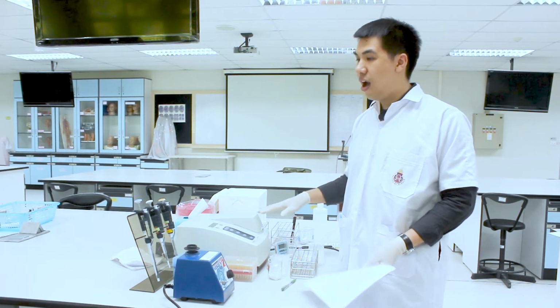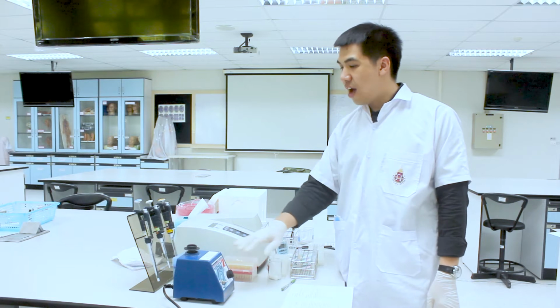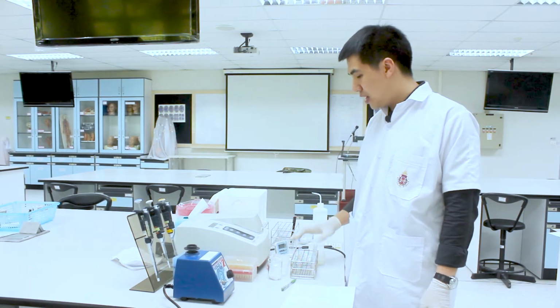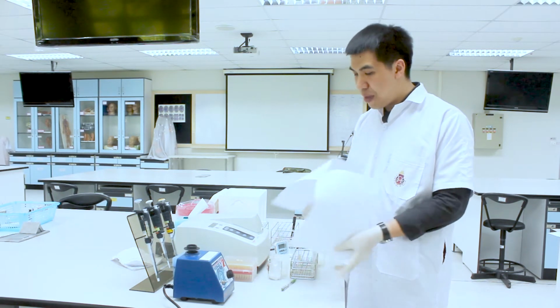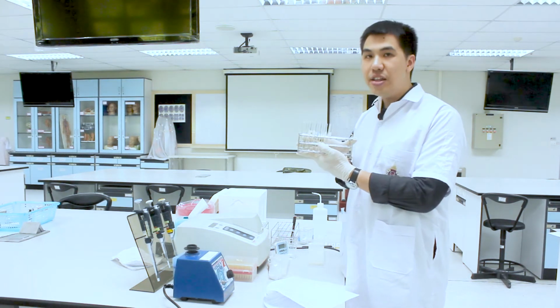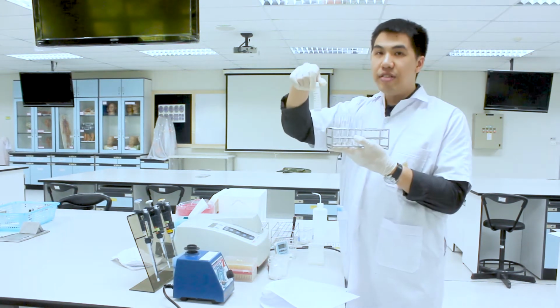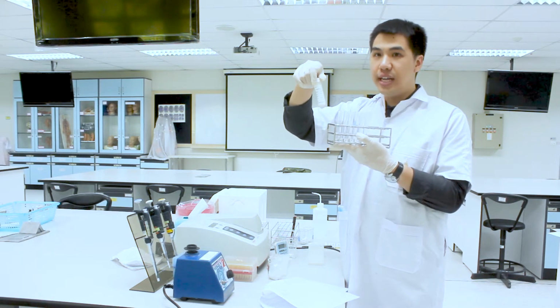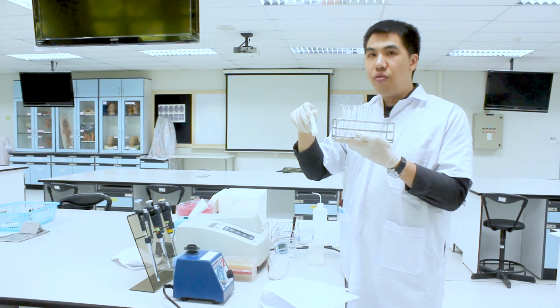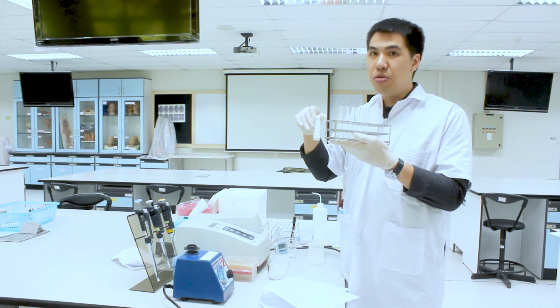The equipment and consumables for this laboratory are the same as in laboratory 3: you have the spectrophotometer, the vortex for mixing, an autopipette, and tips for the autopipette. For the first step, prepare 6 test tubes like this. Then add the cholesterol oxidase reagent into each tube, with a volume of just 1 ml.